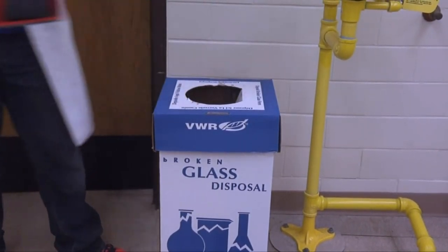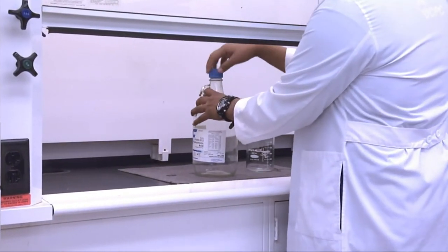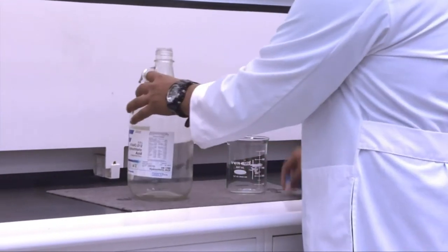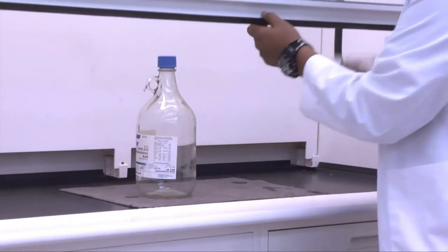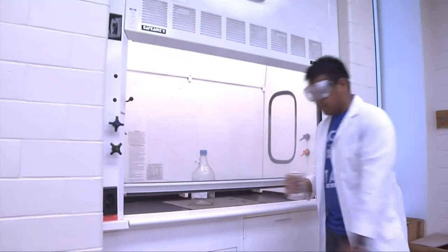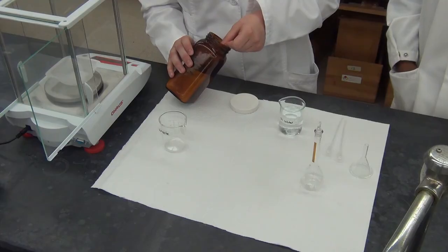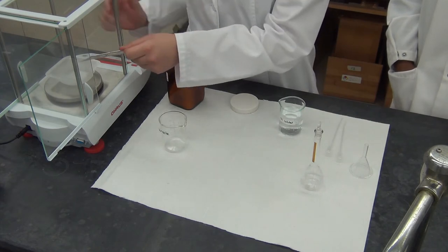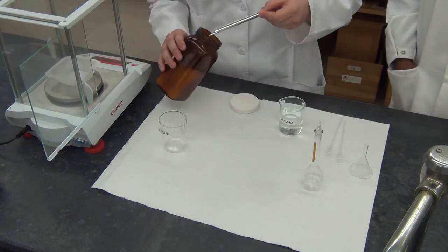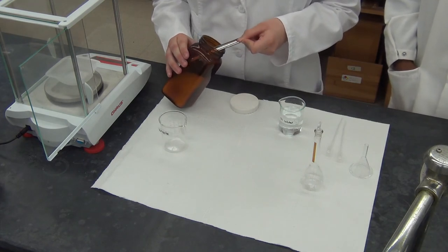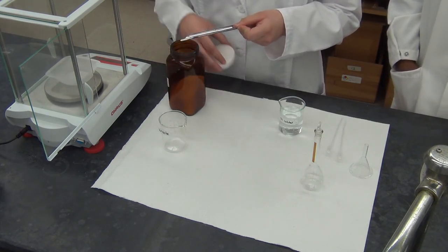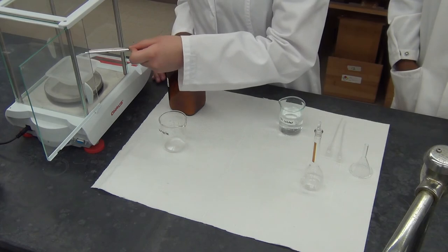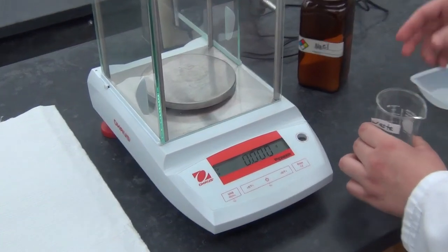Do not remove reagent bottles from their assigned places. Always recap reagent bottles. Some reagents decompose when exposed to the atmosphere for a period of time. Do not stick anything into the reagent bottles. If a spatula is provided for that purpose, be sure that the same spatula is used in the same bottle. If you pour out or weigh out too much of any reagent or solvent from the bottle, do not put the excess back into the bottle. This will risk introducing contaminants into the main supply of the reagent. Unused or excess reagents should be disposed of in the appropriate waste container.